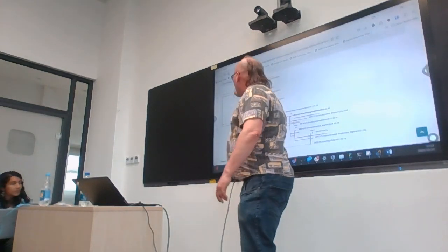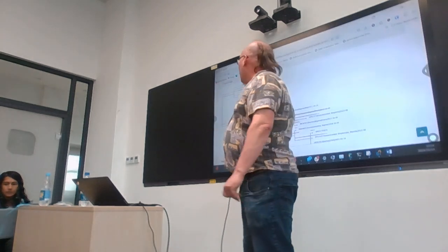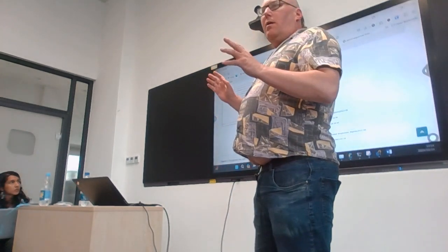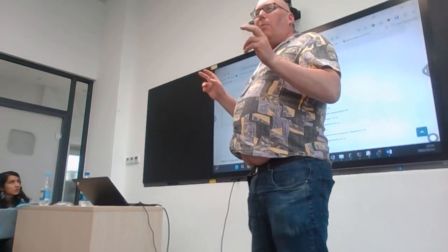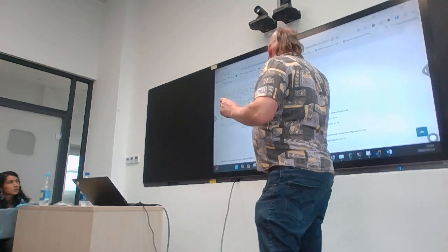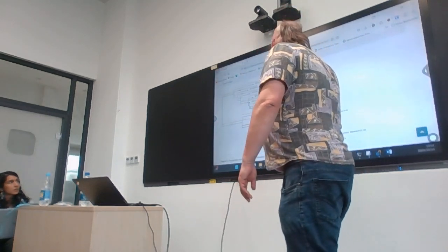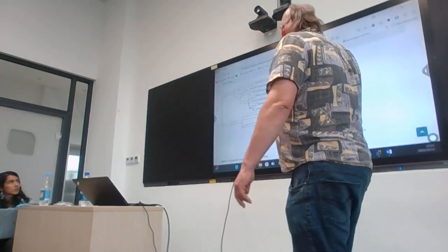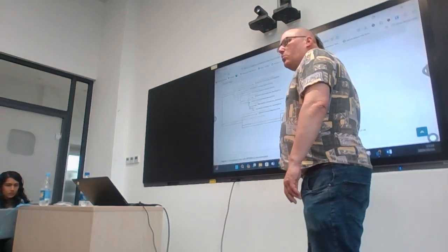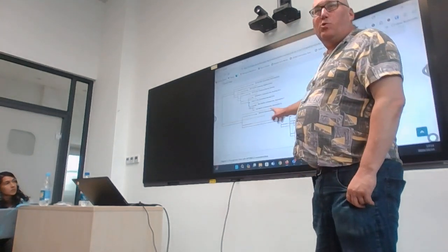The colors of the dots: 1 dot, 1 mutation. If the dot is yellow, it means it is a non-APOBEC mutation. If the dot is brown, maroon, then it is an APOBEC mutation. Now, this part of the side here is the clade 2 that ended up being the global human-to-human transmission.